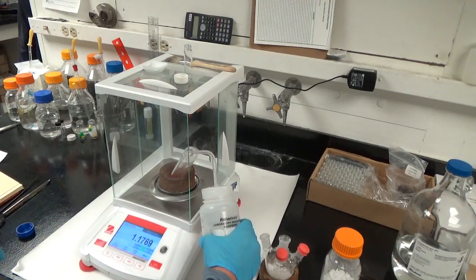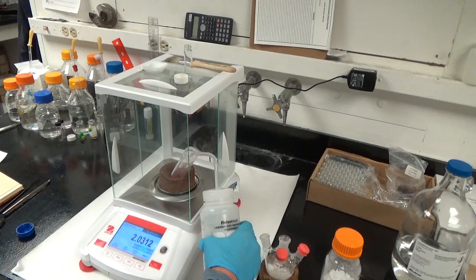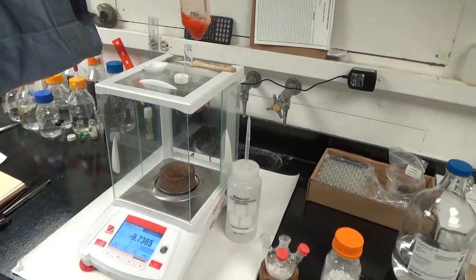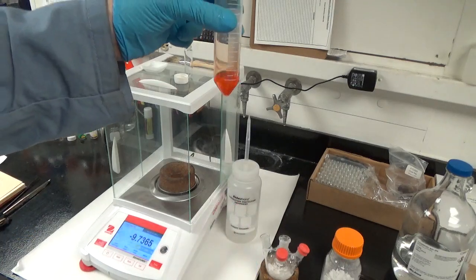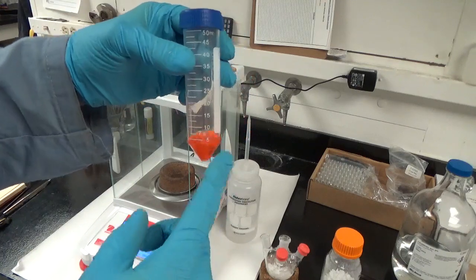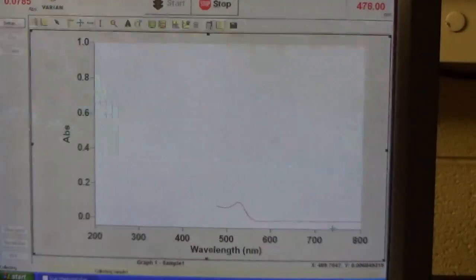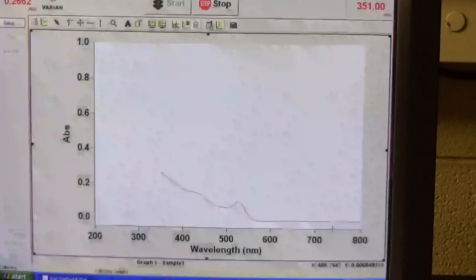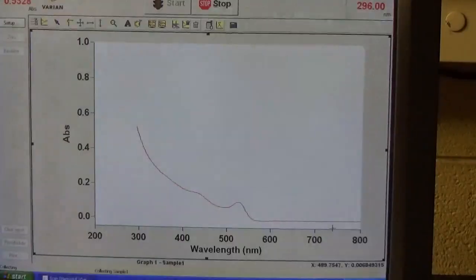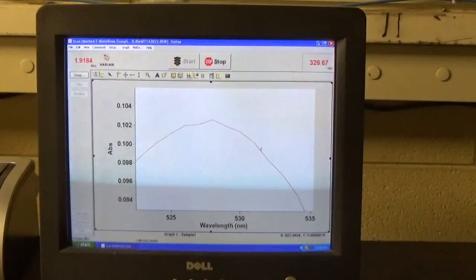Now that I precipitated them a second time - and this is why you got to be careful about how many times you precipitate them - I'm now adding a known quantity of hexane so that when I take a portion of the QDs, this is basically a stock solution. I'm going to take a portion, do a UV-vis spectrum, calculate the concentration, and then knowing my original volume and the concentration of dots in my cuvette, I can back calculate the total moles, à la freshman chemistry type dimensional analysis.